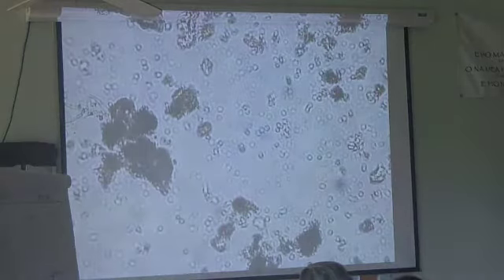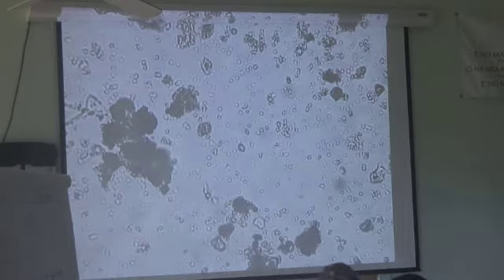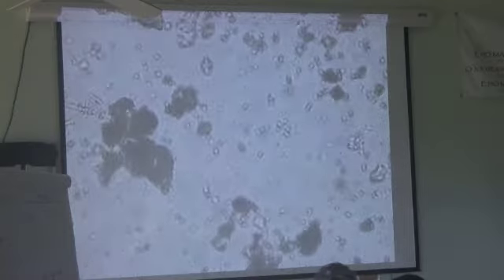Here I go. Now you'll notice that as you dial your 40x objective in here, I think it's going to hit. Oh no, I think it's going to hit. So be watching and make sure it doesn't actually hit. And you'll notice you've got this little bit of space between your objective and your sample. So it can be quite scary.